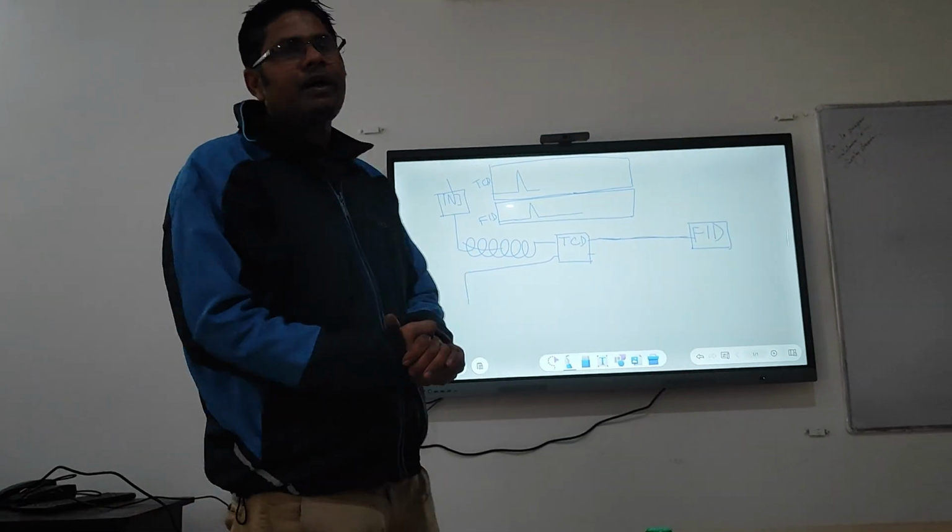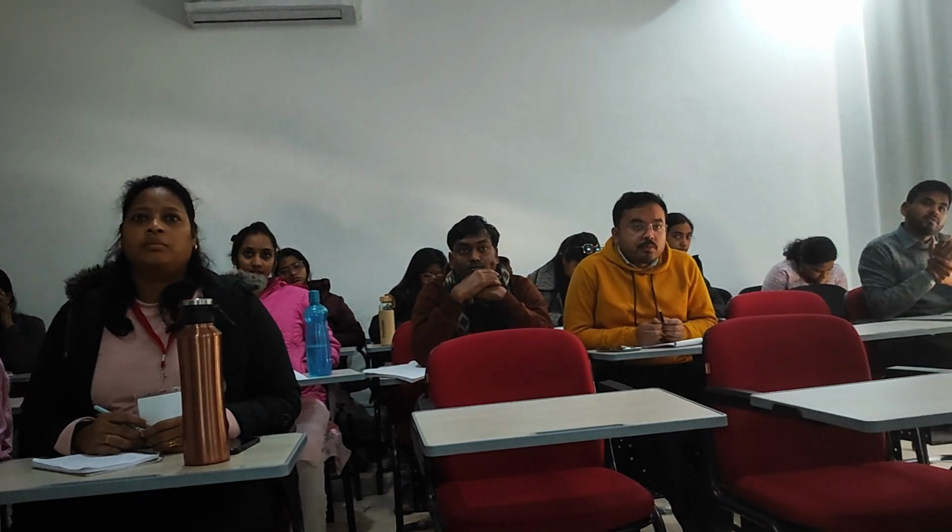So what is the purpose of the column? Can anyone tell? Detect the correct compound, detection. Okay. Any other? Separation. The column is not detecting anything. Only separation.